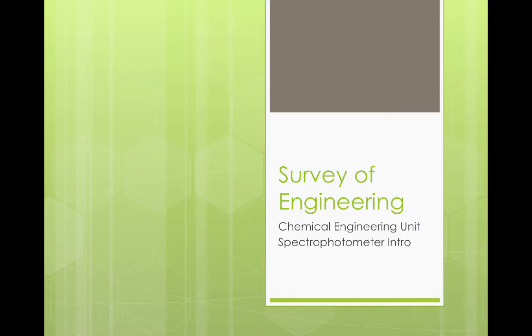We are in our Chemical Engineering unit, and today we are going to introduce our spectrophotometers and help you understand how you're going to build a spectrophotometer and why we want to build one.